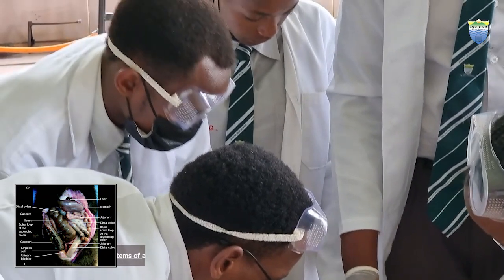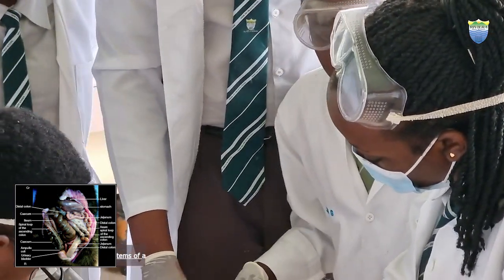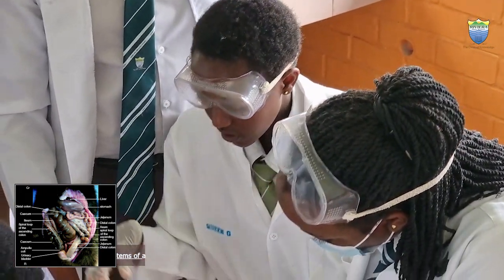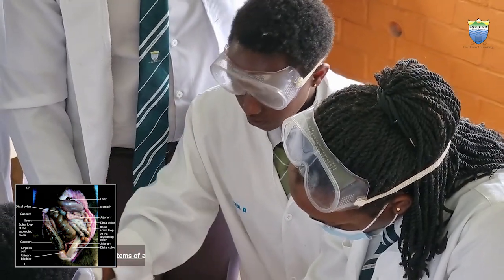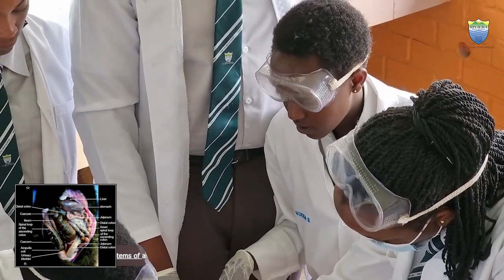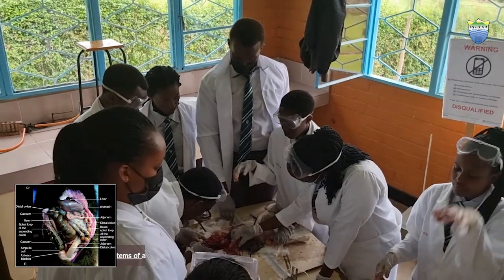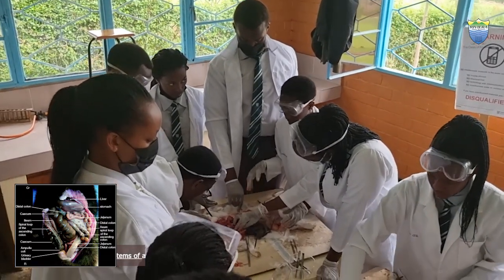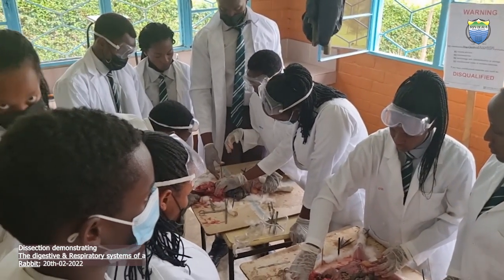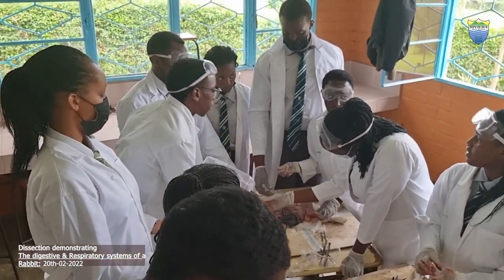By the teeth, when the food has been chewed, it is the tongue that keeps on rolling the food, and when it swallows, it goes through the oesophagus. The oesophagus is like a lumen, like a tube whereby the food keeps on going down by contraction. As the gullet keeps on contracting, the food keeps on going down as a small ball of food.